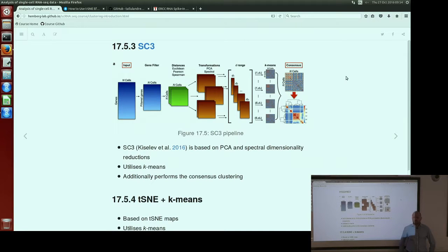Yes, there are multiple data sets where you have several hierarchies. For example, you have 4 large cell types, and then inside each cell type you have some sub-cell types. Basically both answers would be correct in this case.